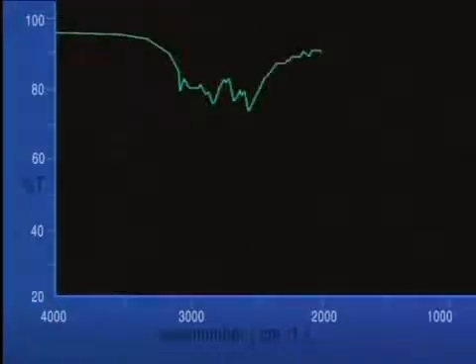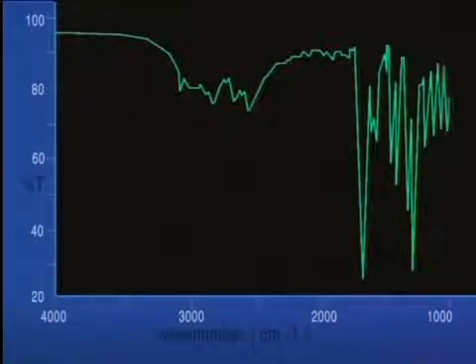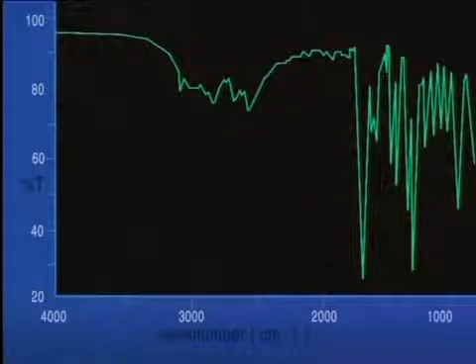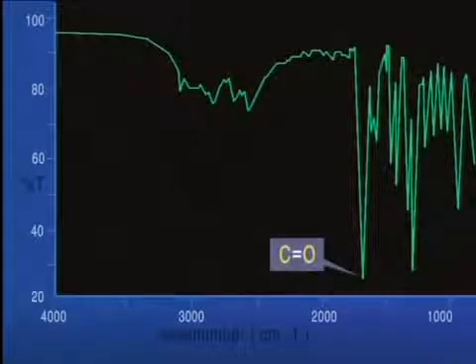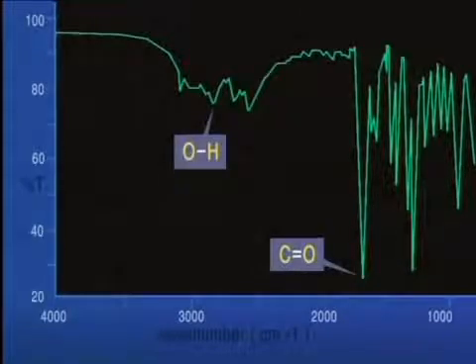The wave numbers of the more significant peaks can be labelled onto the spectrum. This helps the chemists to interpret the data. This peak is caused by a stretching vibration of the C double bond O, and this by an OH stretch. These two peaks together suggest that the sample may have a carboxylic acid functional group, which has both C double bond O and OH bonds.